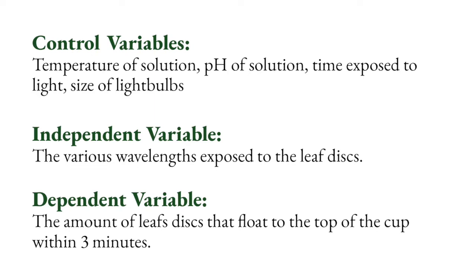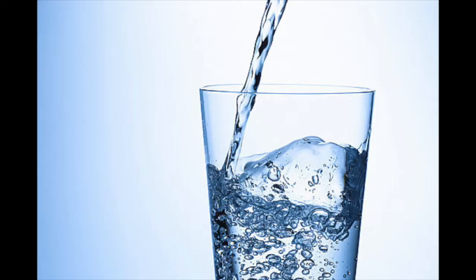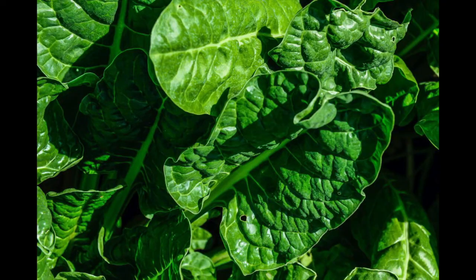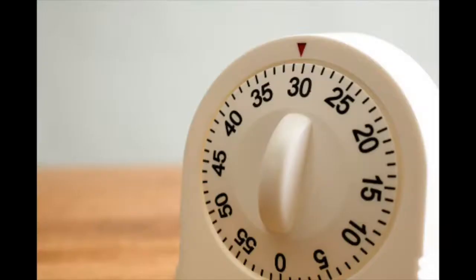Independent variable: the various wavelengths exposed to the leaf disk. Dependent variable: the amount of leaf disks that float to the top of the cup within 3 minutes. The materials needed include baking soda, a weighing scale, water, liquid dish soap, straws, spinach leaves, a syringe, 250 milliliter beakers, filters of wavelengths of light in the colors green, purple, and red, and a timer.